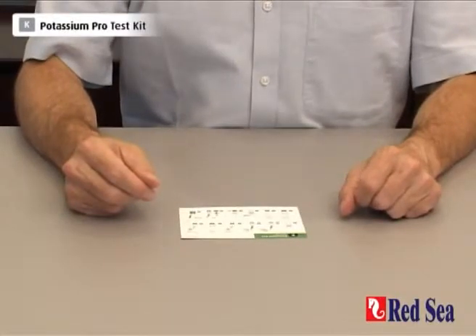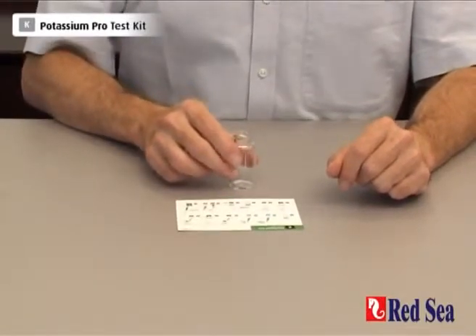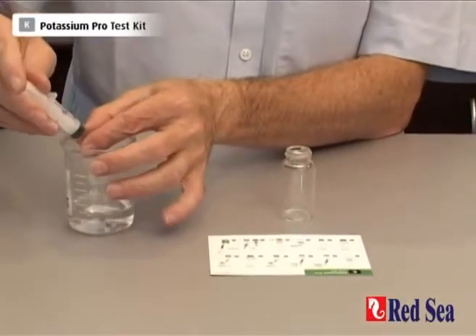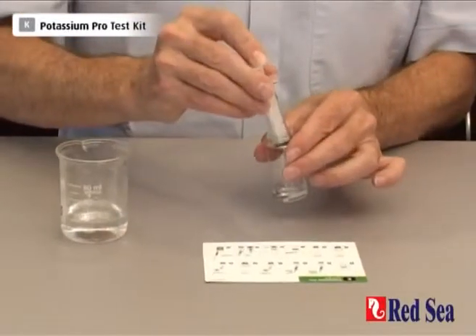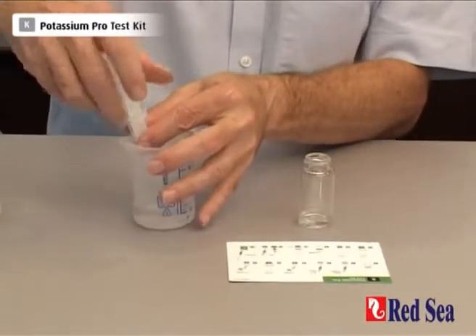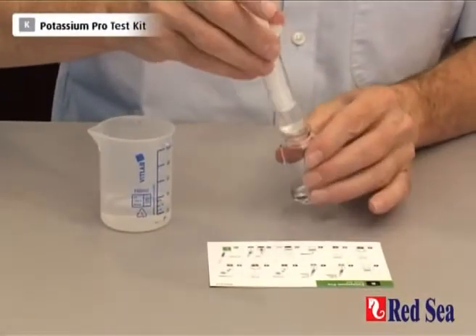The first part of doing this test is mixing 2ml of aquarium water with 3ml of RO water. Let's do that now — 2ml of our water sample with 3ml of RO water.